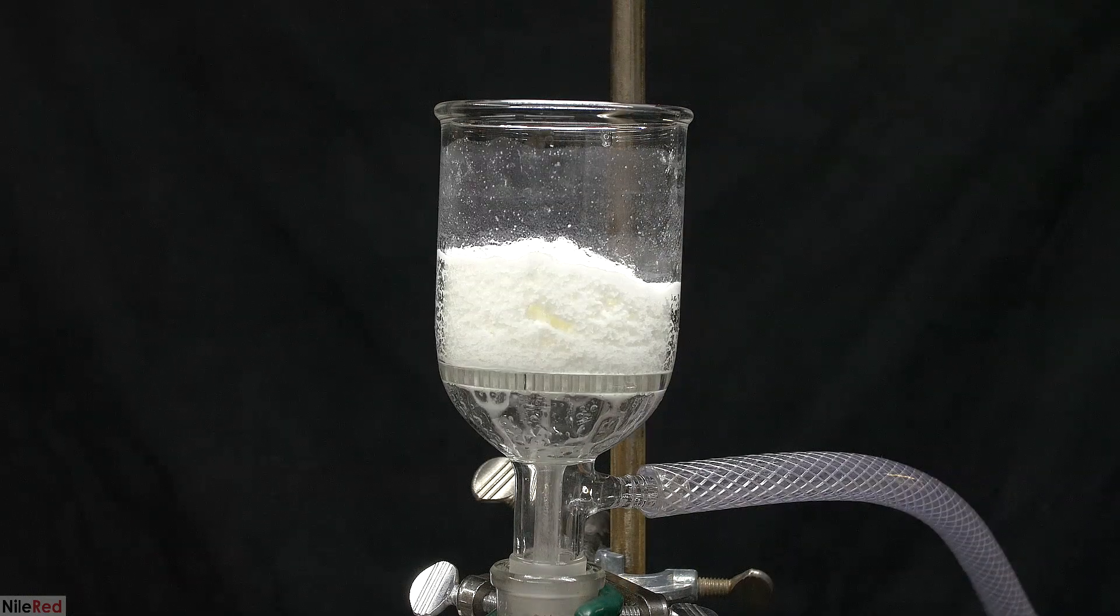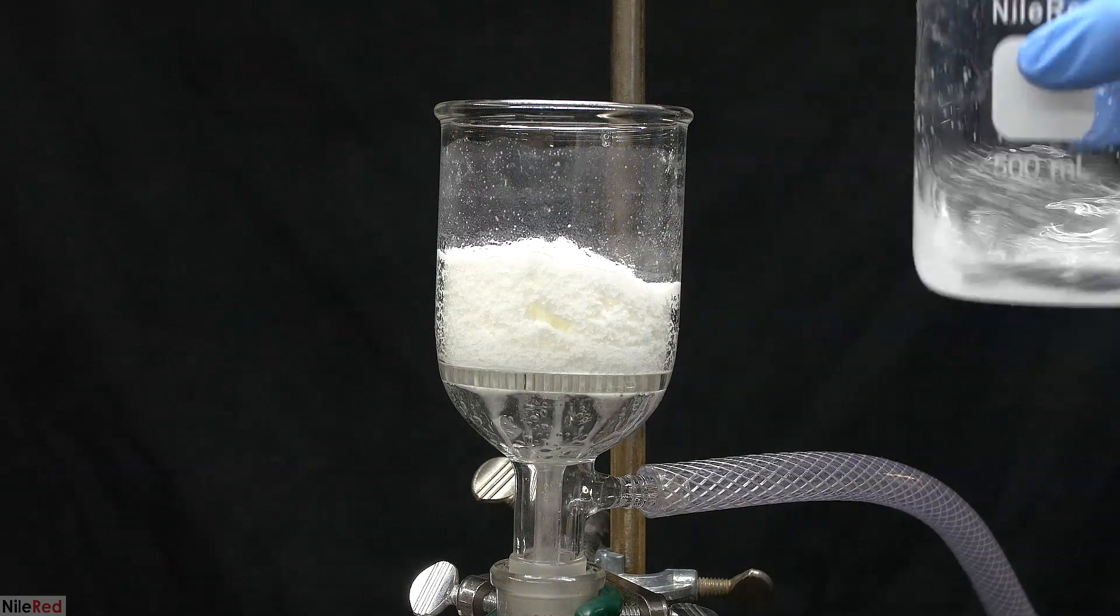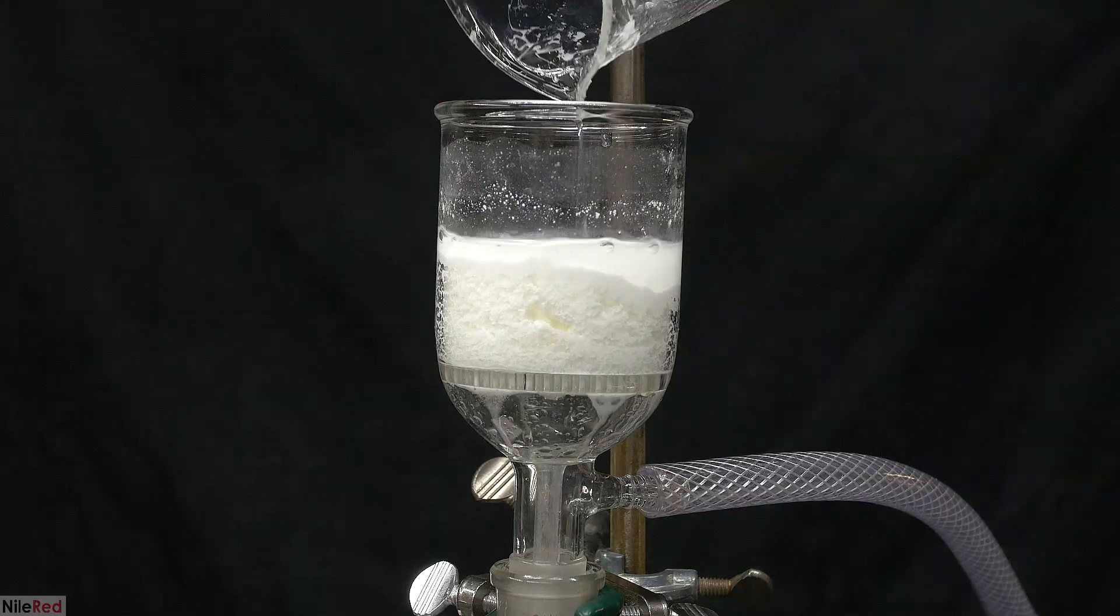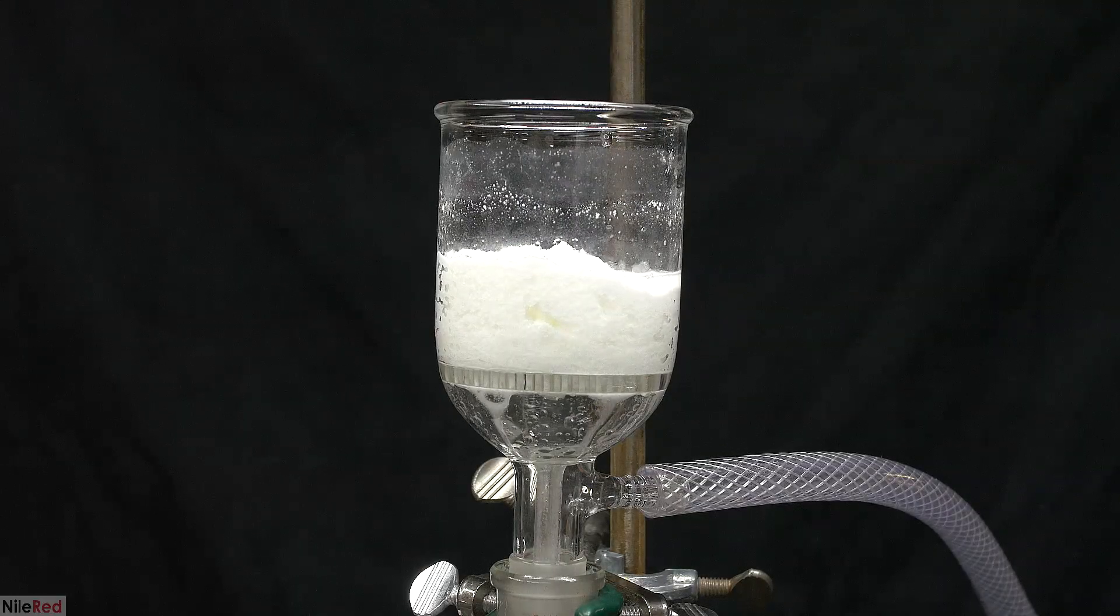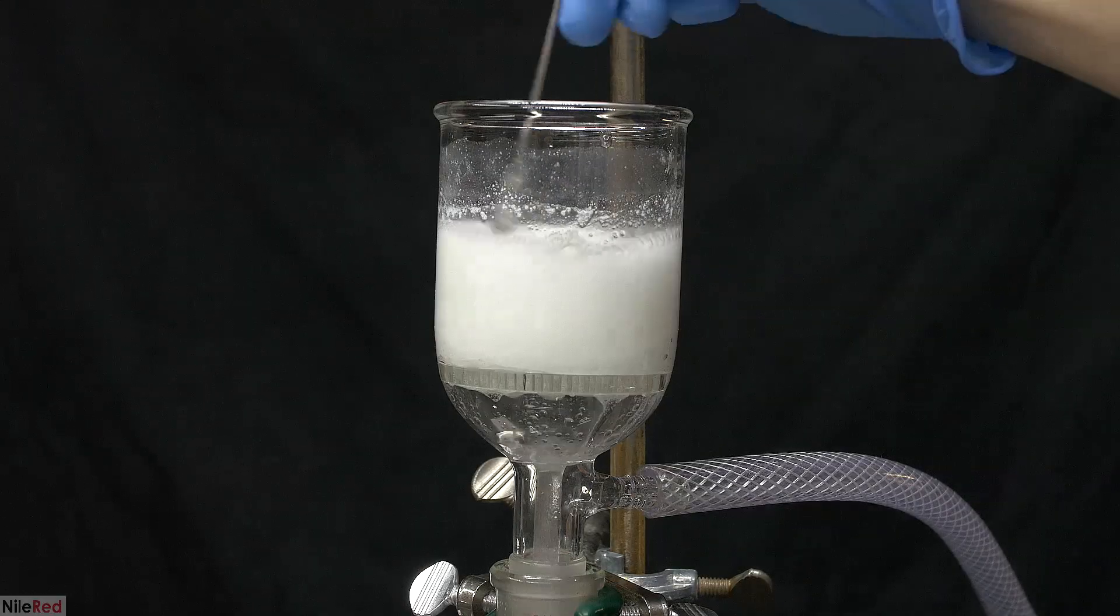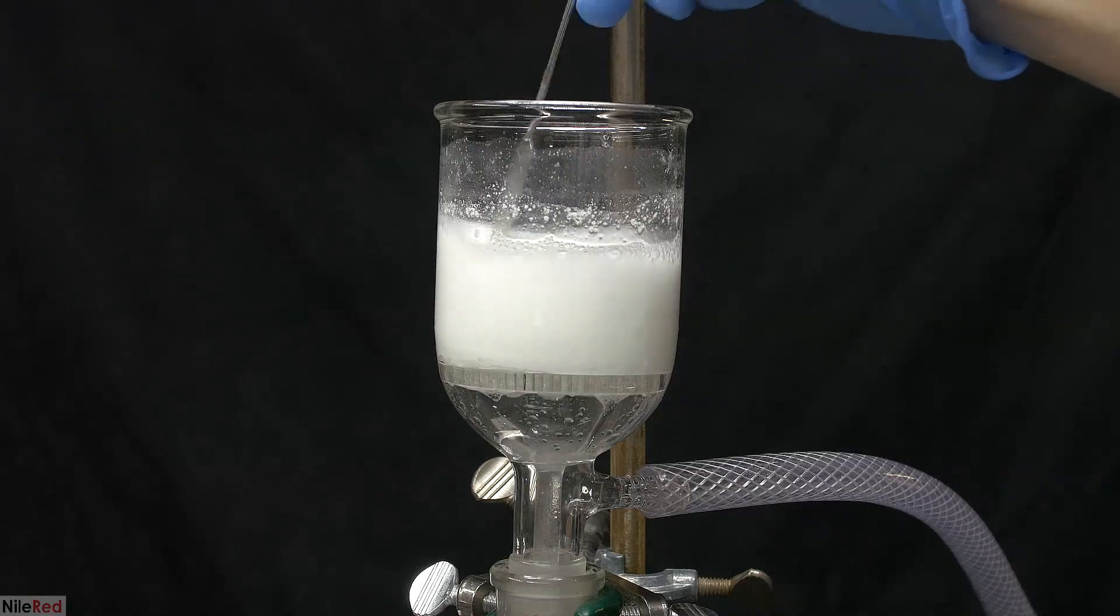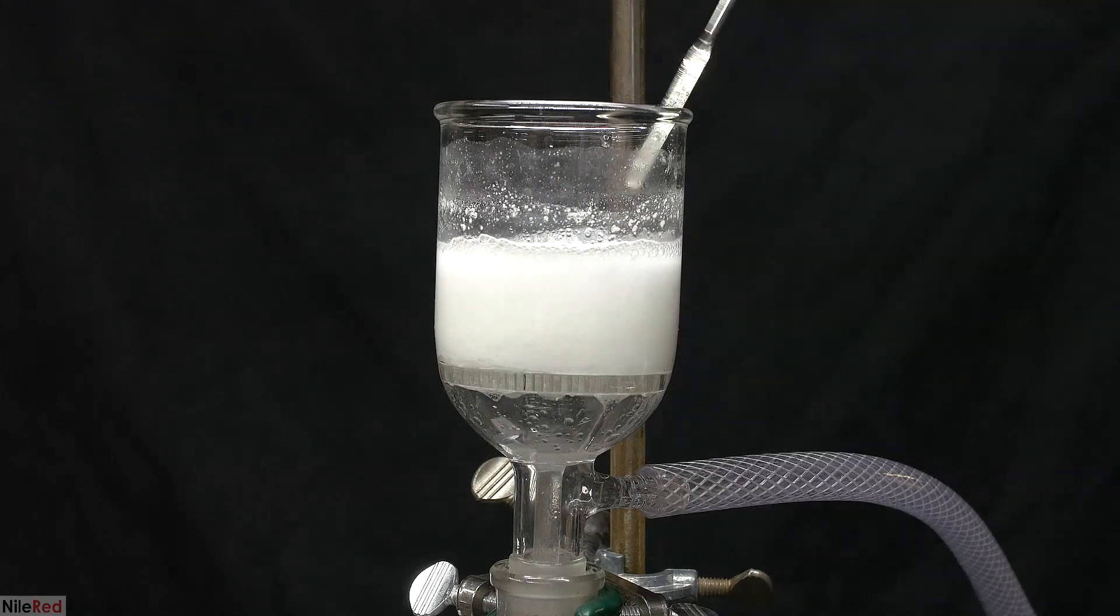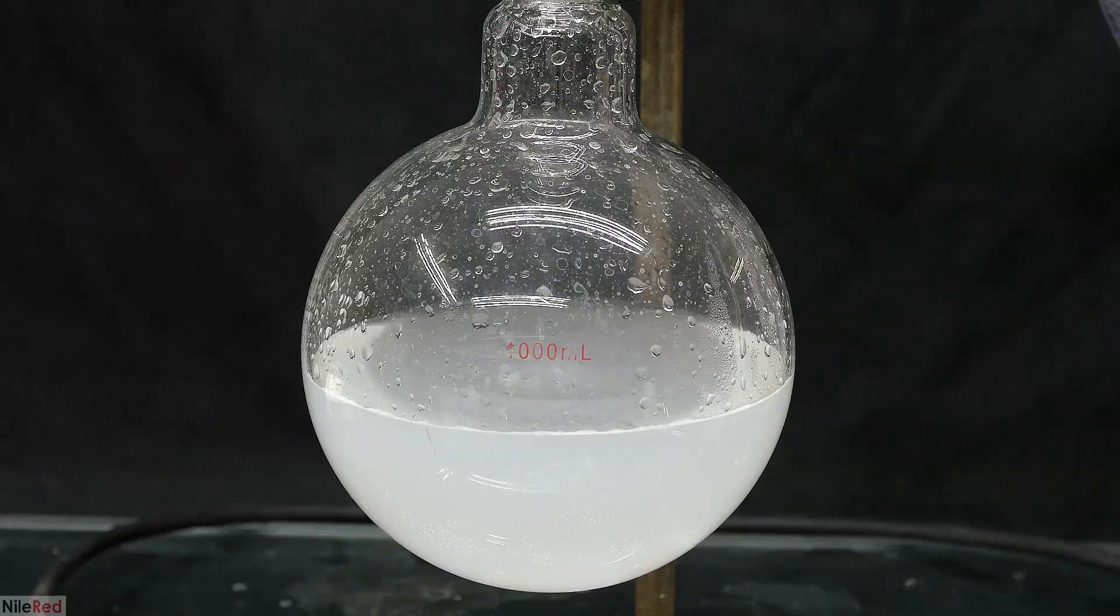All of the impurities that made the solution opaque should still be present, and because they passed through the filter, I figured that I could probably wash them away here. So using ice cold water, I washed the adipic acid a few times. In the flask below, you can see that what I'm collecting is opaque.